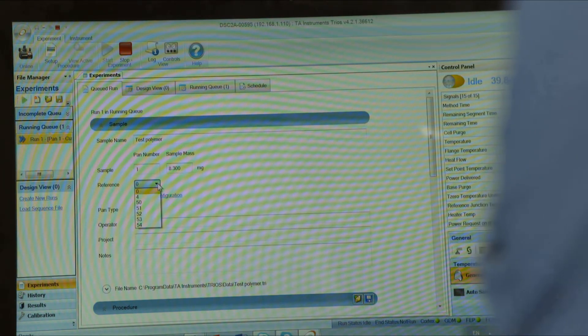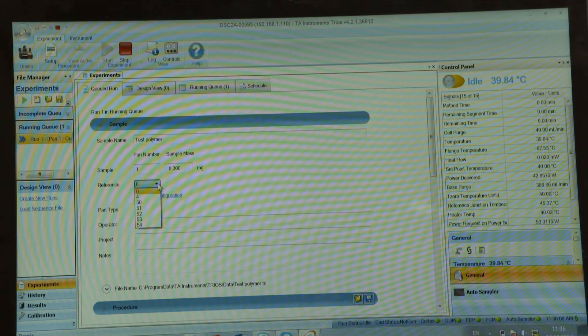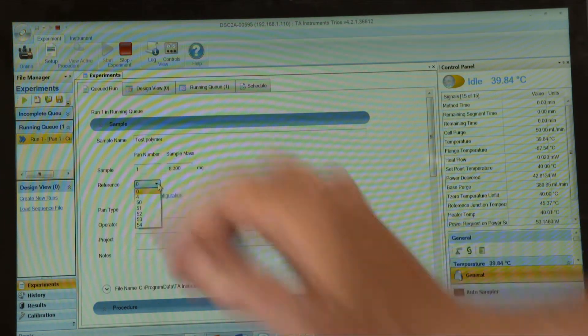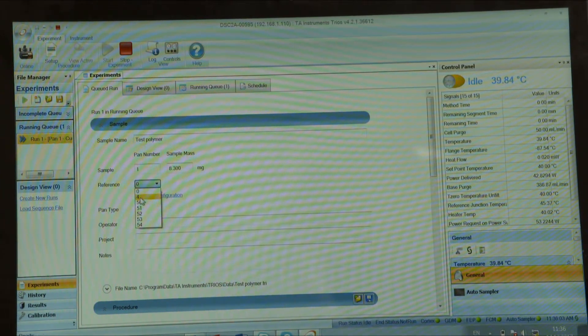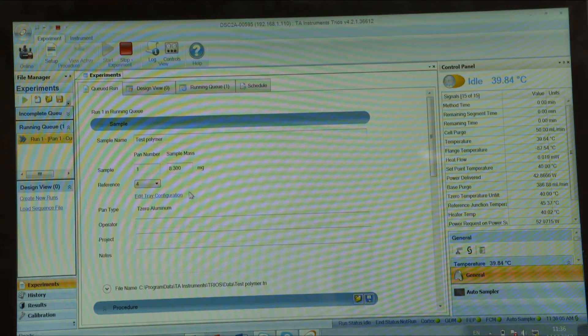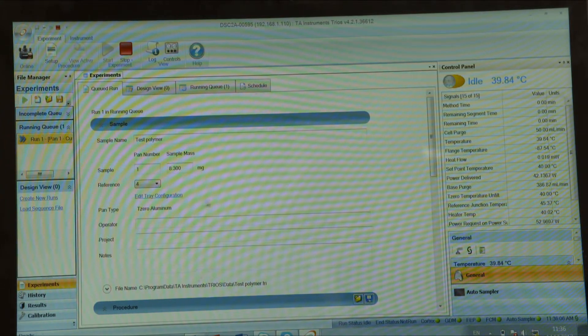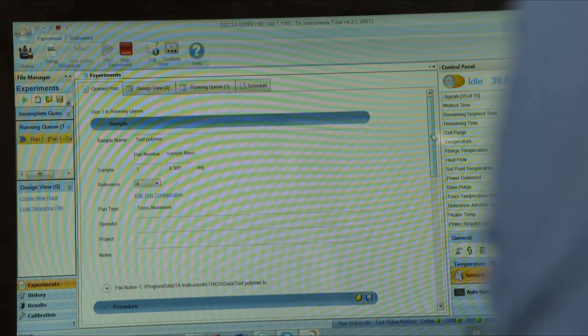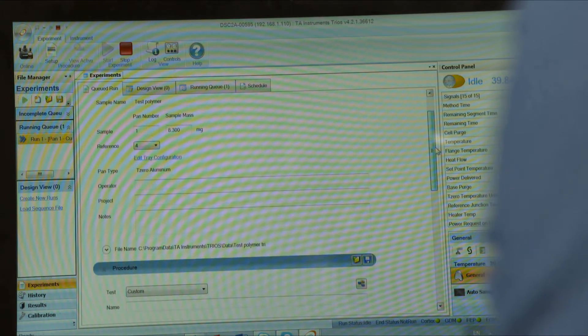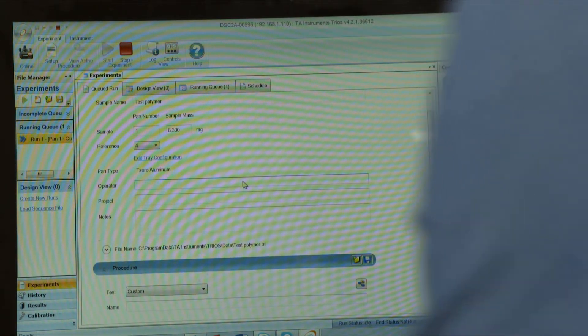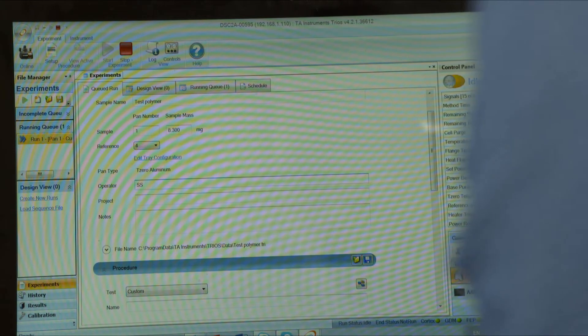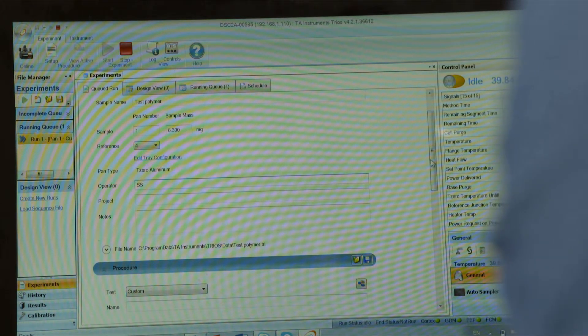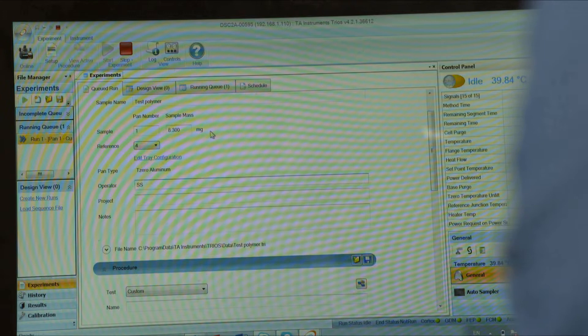You need to put position for your reference pan, so for example we use position four. Enter operator. File name is shown as a sample name.